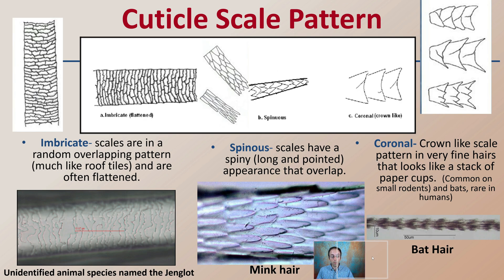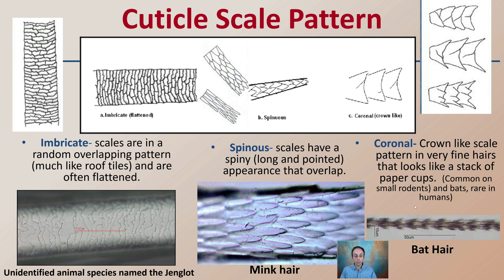The cuticle scale pattern is another area we want to look at. Imbricate scales are random overlapping patterns, much like roof tiles, and are often flattened. Spinous scales have a spiny, long, and pointed appearance that overlap — you can see that clearly in the mink hair. Coronal scales are crown-like patterns found in very fine hairs; it looks like a stack of paper cups, common in small rodents and bats, and very rare in humans. Bat hair is clearly very distinctive compared to mink hair or an unidentified animal with the imbricate scale pattern. This is an important method for classifying hair to a particular species.